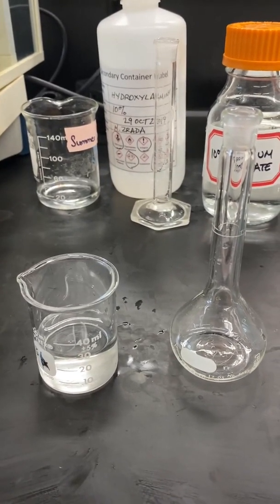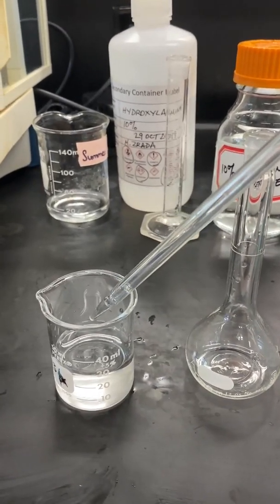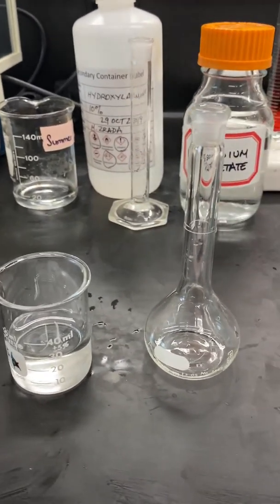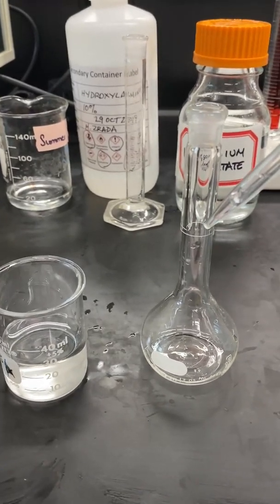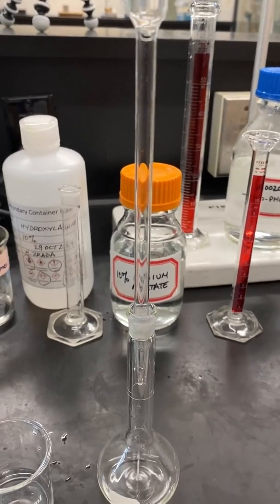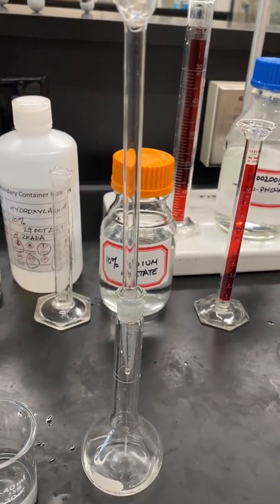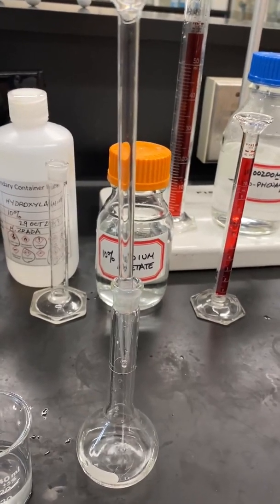Pour the contents of Stock 3 into a clean, dry beaker. Then pipette 10 milliliters of Stock 3 into a clean 50-milliliter volumetric flask and drain the 10 milliliters into the 50-milliliter volumetric flask.